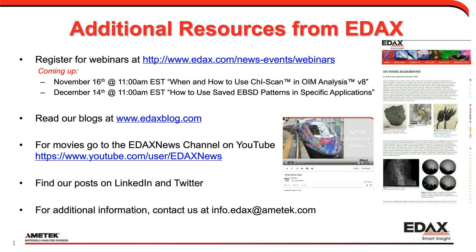So you're going to speed up your collection, you're going to get more counts through, more throughput, and more counts throughput is more statistics. More statistics translates into better quantitative results. So for all of those data points that you gather in a map, you want to have the highest input count rate, and you can do that with your pulse processing time.